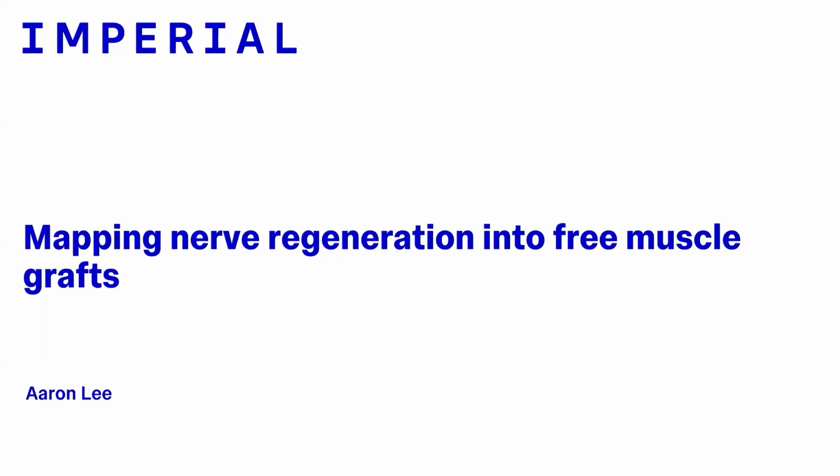And today I'll be talking about mapping nerve regeneration into free muscle grafts, and specifically how the new Mica platform has been integrated into our workflow, and how it's been useful to understand some of these biological processes.